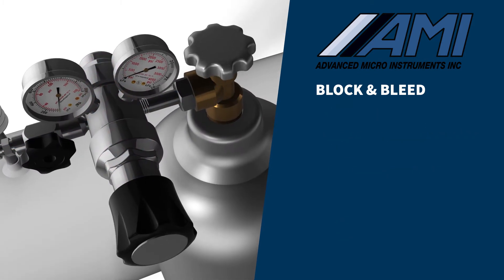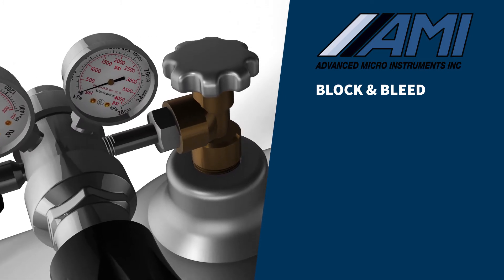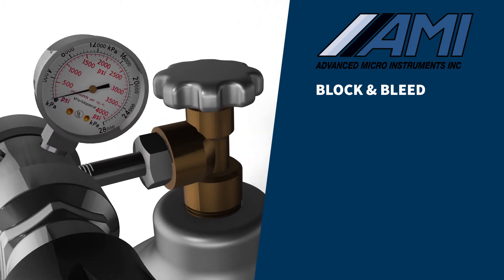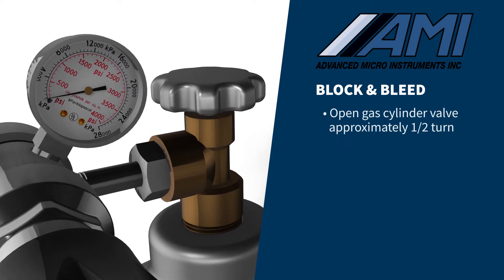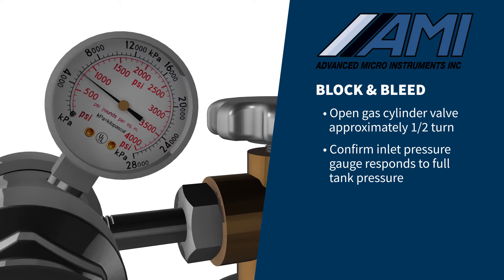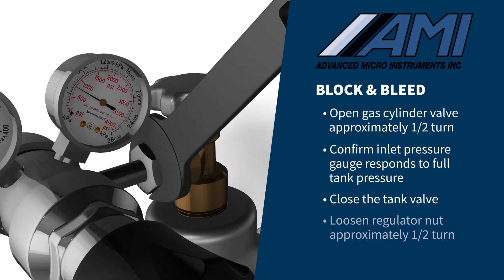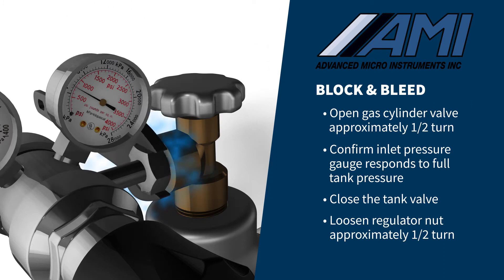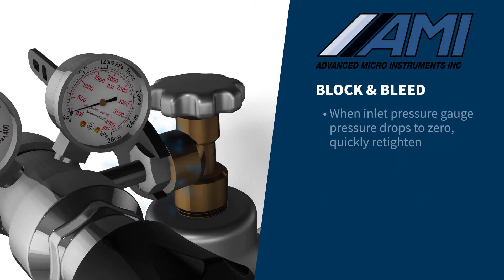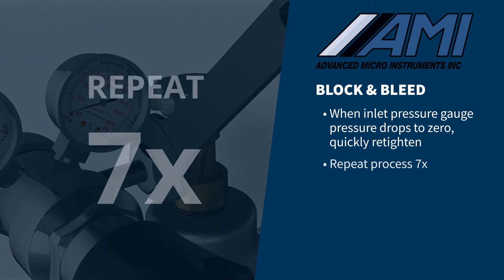A proper block and bleed of the regulator starts with the high-pressure side of the regulator. With the regulator securely attached to the span gas cylinder, open the gas cylinder valve approximately one half turn, confirming the inlet pressure gauge responds to full tank pressure, then close the tank valve. Using the tank wrench, loosen the regulator nut approximately a half turn until the inlet pressure gauge drops to zero, and quickly retighten the tank nut to the tank. Repeat this process seven times on the high-pressure side of the regulator.